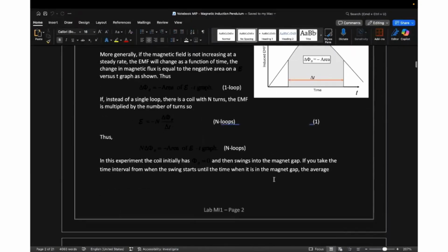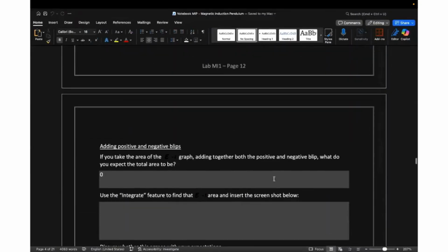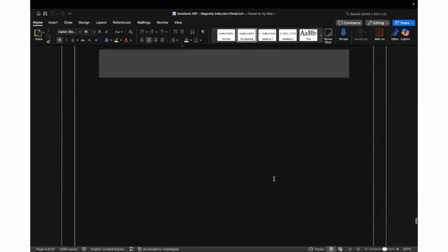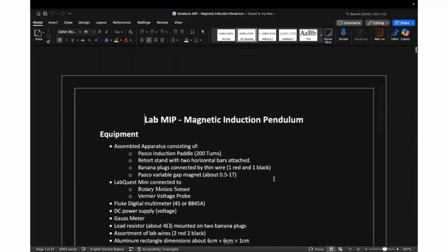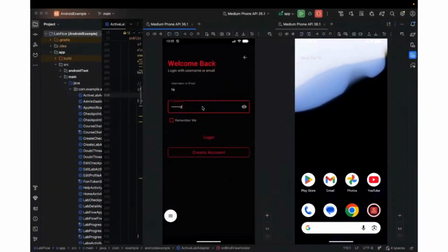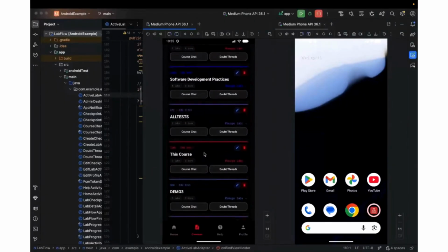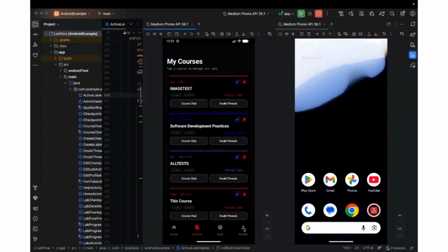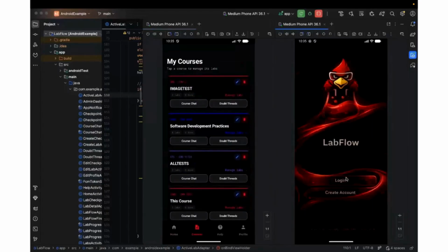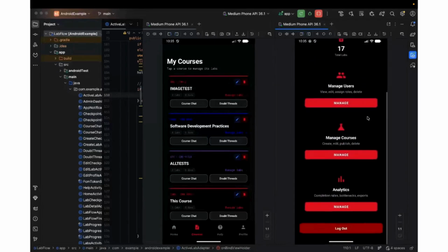Welcome to Labflow. Have you ever been to a lab where the instructions or the lab manual is just so long? We as students have faced so many labs where we have instruction manuals that are bigger than our textbook. There's no need for it being so verbose, and so we decided to break it down into simple steps. Labflow allows students to complete labs in quicker time, understand more, and pay more attention to each concept since there is not that much time waste.